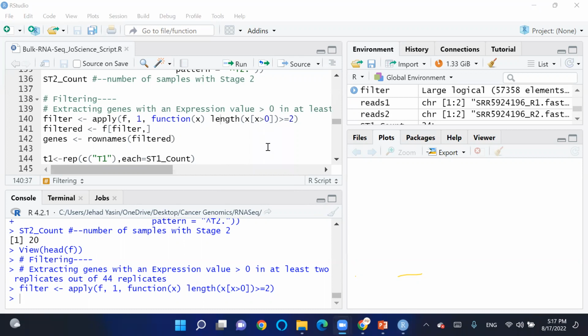We can save the data from these text files. Yes, we can save to Microsoft Excel, and we will do this later.